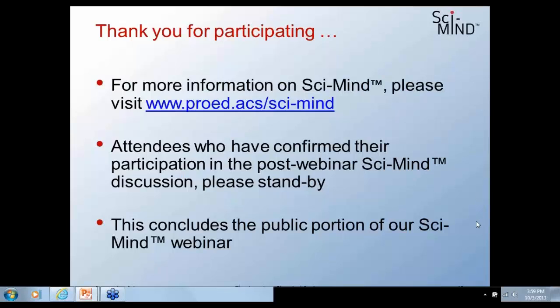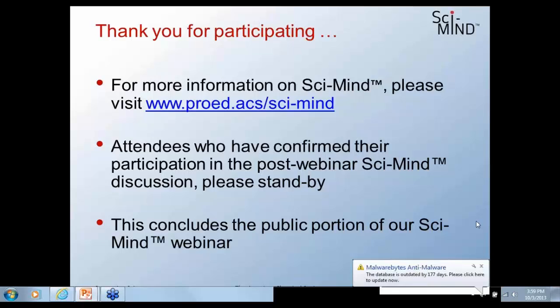Okay, actually, I love this one. It says here: how do you use partition coefficients, either octanol-water or log P, to select your column or your sample prep? I love the question, because especially if that data is available to you, either from your own development folks or in the literature, I think it's very useful.